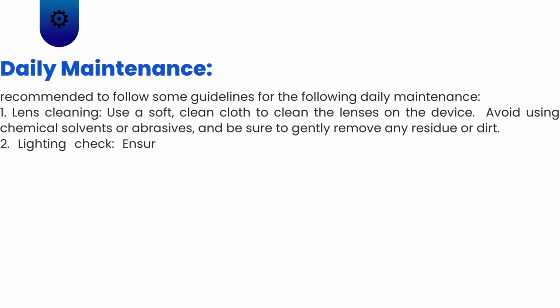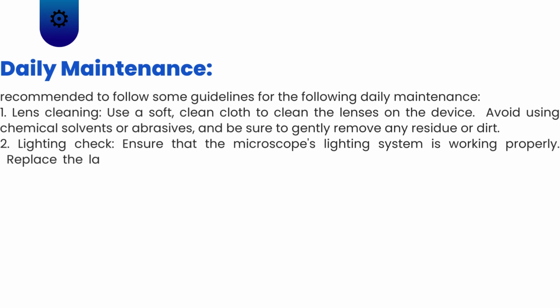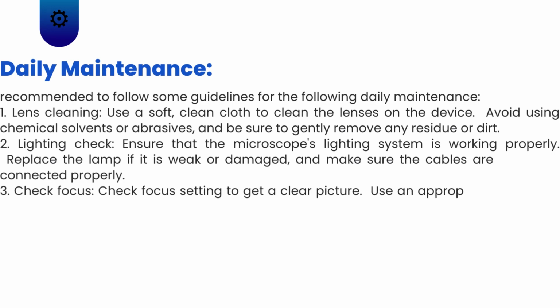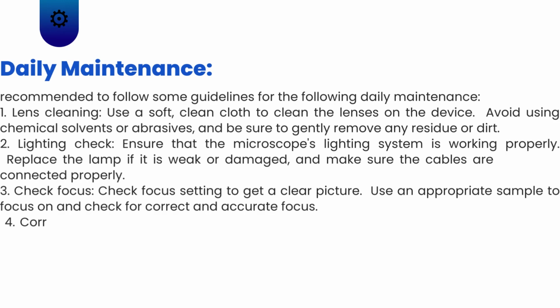2. Lighting check. Ensure that the microscope's lighting system is working properly. Replace the lamp if it is weak or damaged, and make sure the cables are connected properly. 3. Check focus. Check focus setting to get a clear picture. Use an appropriate sample to focus on and check for correct and accurate focus.